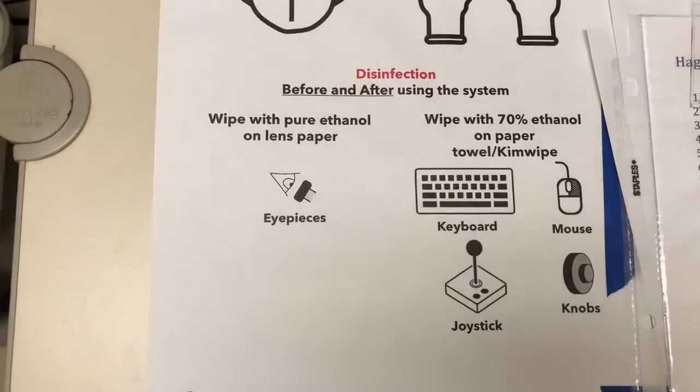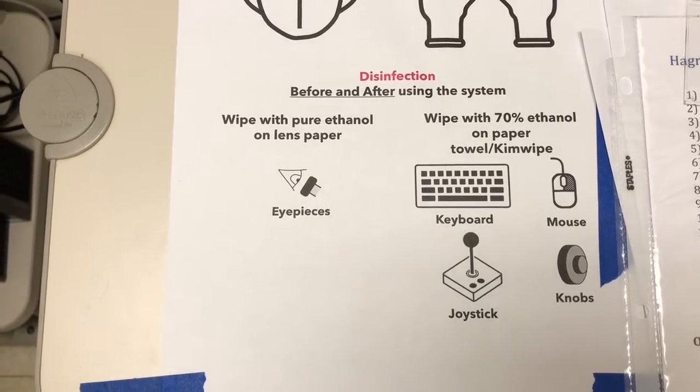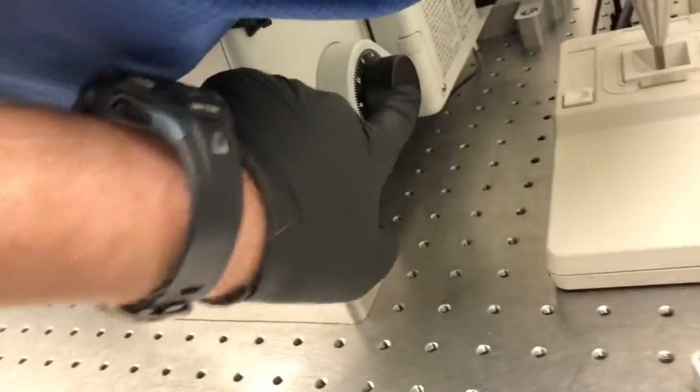We're going to disinfect with pure ethanol on lens paper the eyepieces, and then 70% ethanol on paper towels or kim wipes: the keyboard, the mouse, the joystick, and the knobs.